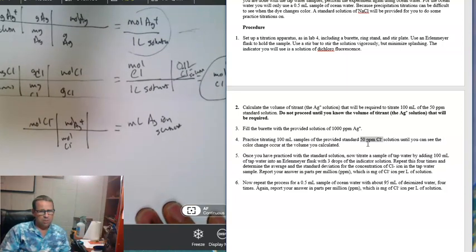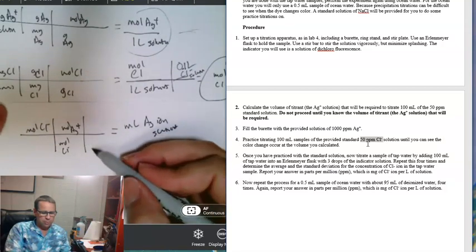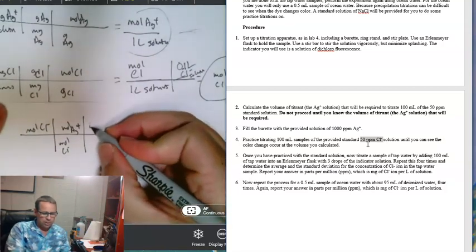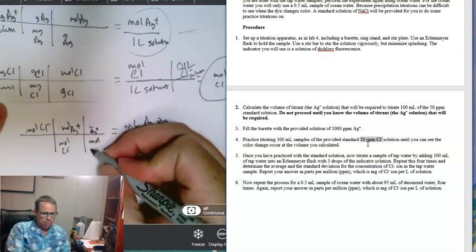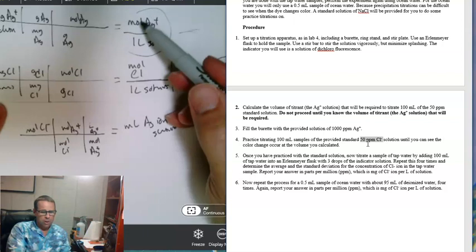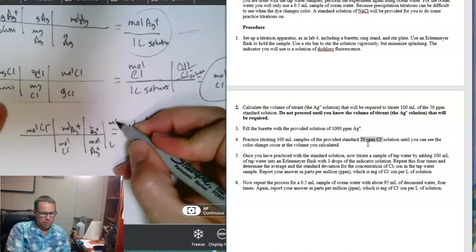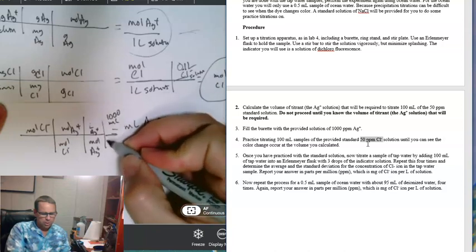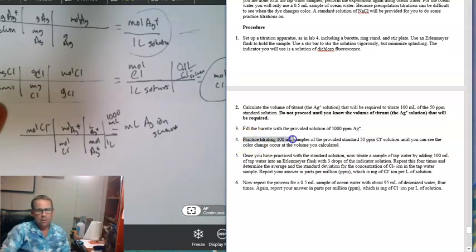reaction there, right? Okay, and then we can get moles of silver ion into liters of silver ion by using the molarity, moles of silver ion. So whatever our calculated molarity is up here, moles per liter, and then go liters to milliliters, 1,000 milliliters to liters, to get the milliliters of silver ion necessary to perform this titration, right? Those are our practice titrations. Okay? All right, that's pretty much it.